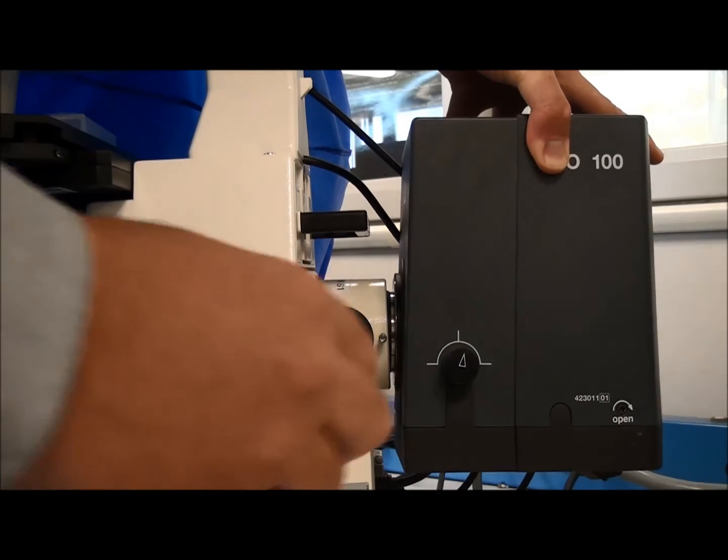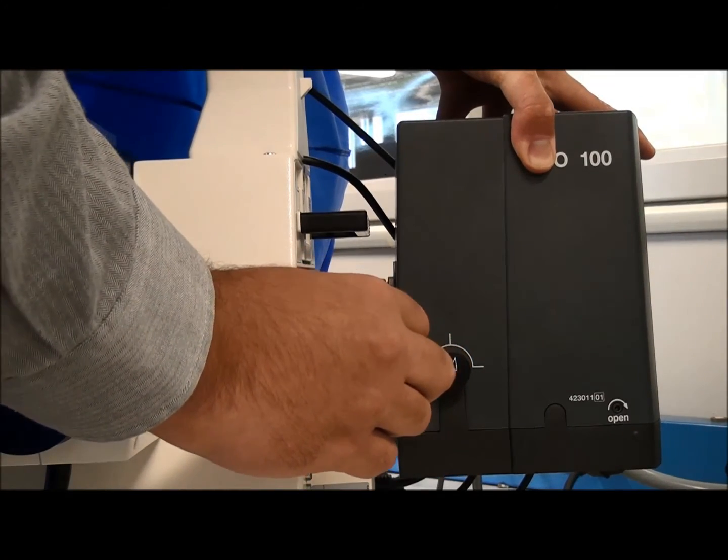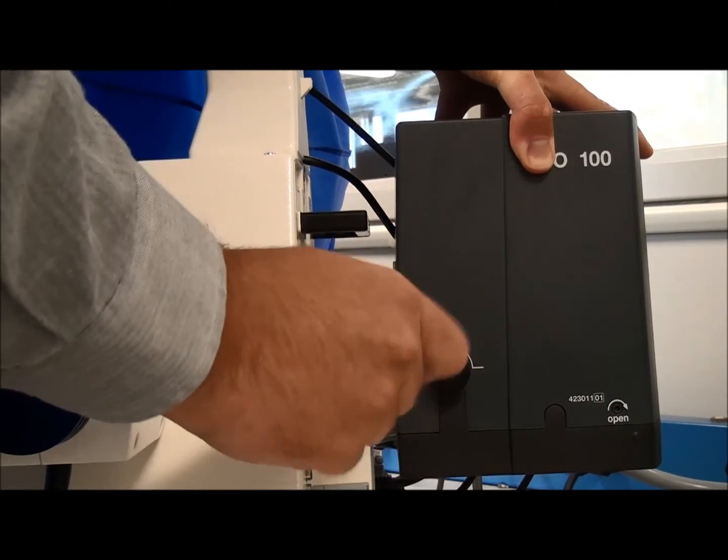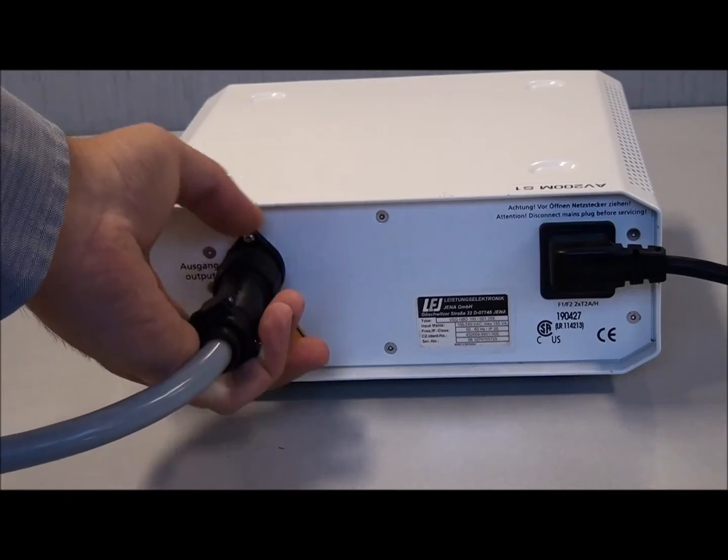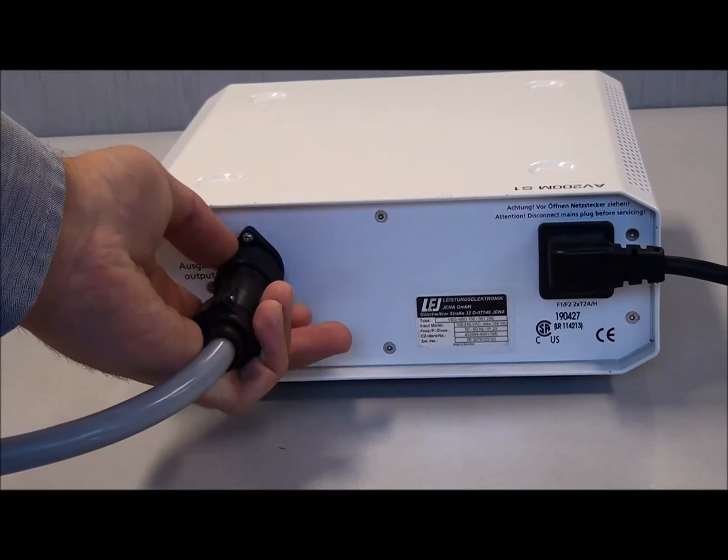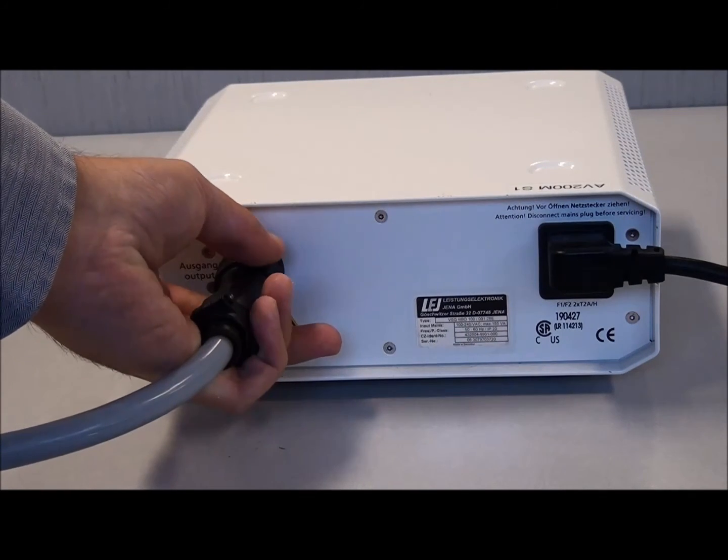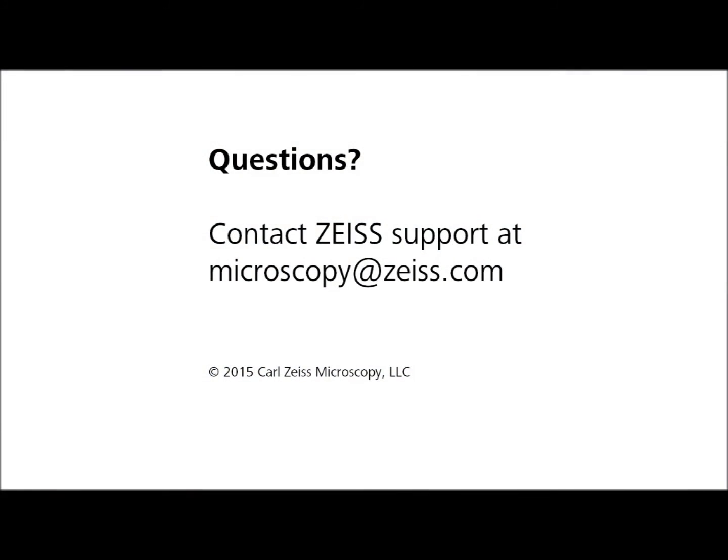Replace the lamp housing onto the back of the microscope. Reattach the power supply to the control box. Your new bulb will most likely need to be aligned. Follow the specific instructions for your lamp housing model. Contact support for more information.